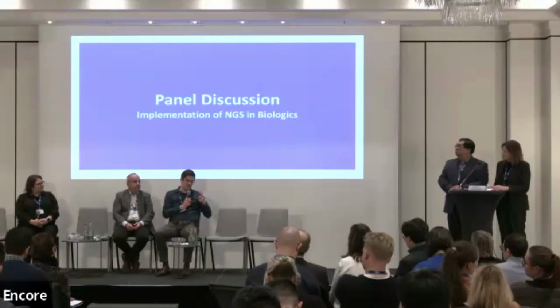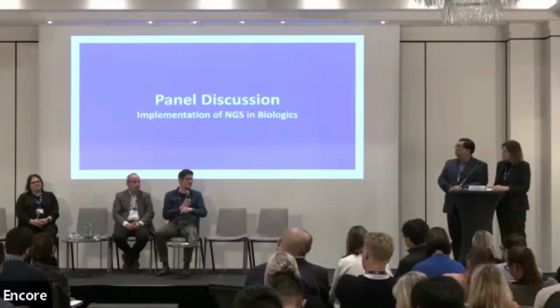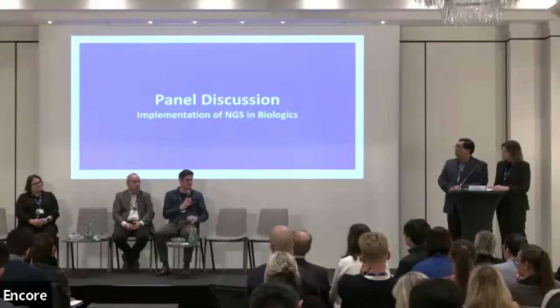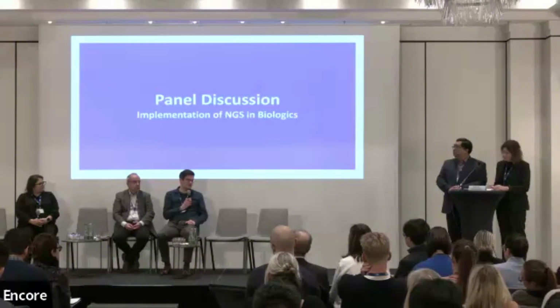But our database, we currently screen for about 40,000 different viral species and strains. At least we are very certain that those 40,000 are not in the test sample. So yes, there might be something new there that's not in the database. That's true, so that's something we have to look at. But that goes for our current pipeline as well, which is fully read-map based. There is always some dark matter, unfortunately.